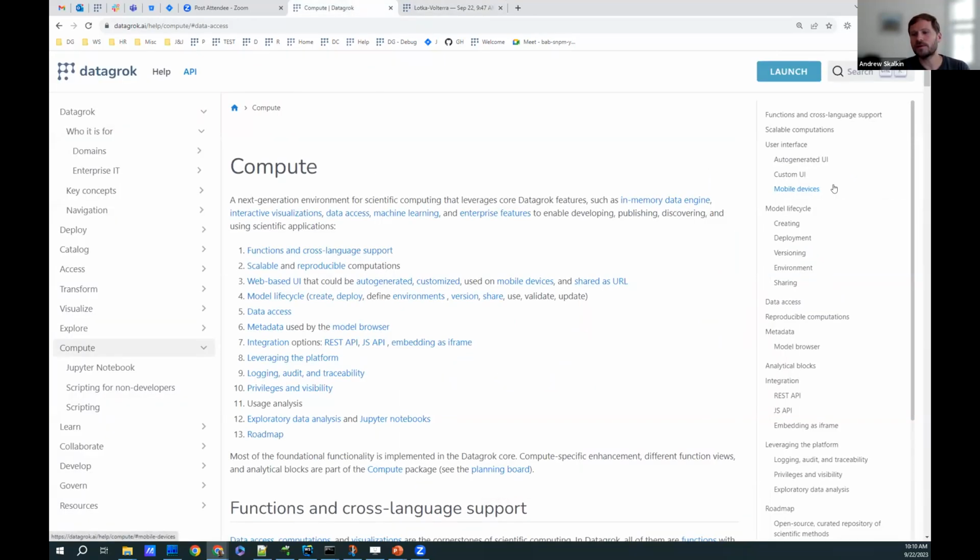And really, if you think about it, many universal and important things could be applied universally to a function. And now I will list the features that, again, you get from Datagrok platform for free once you publish your function. So you only have to deal with the actual mathematics, the actual computations, and then just apply minimalistic annotations to parameters and get working applications.